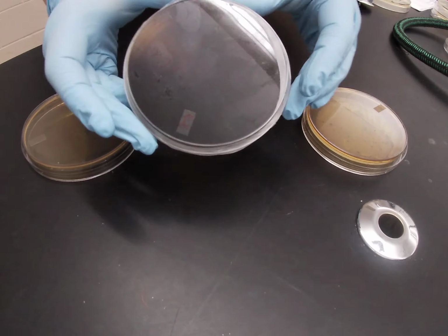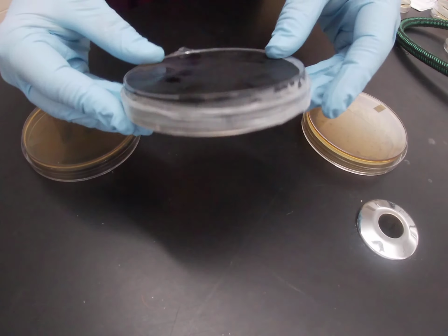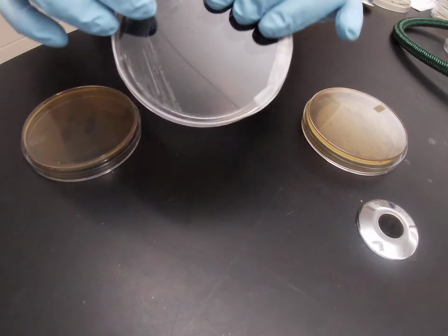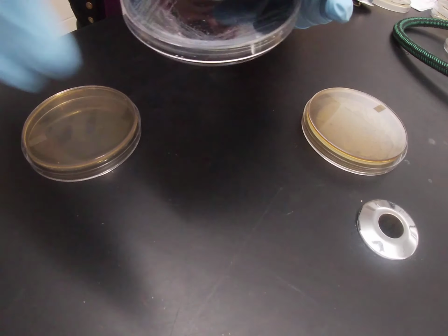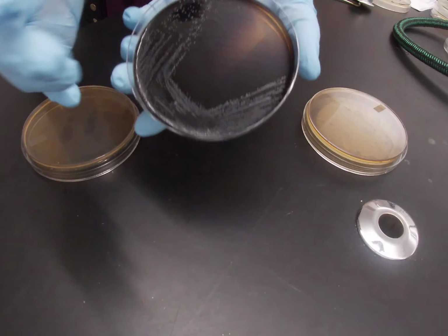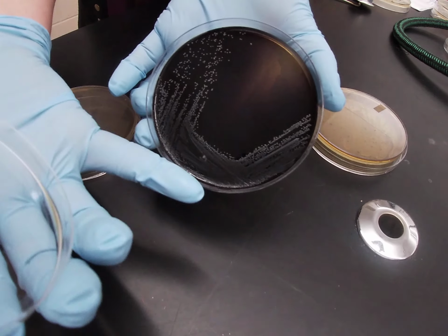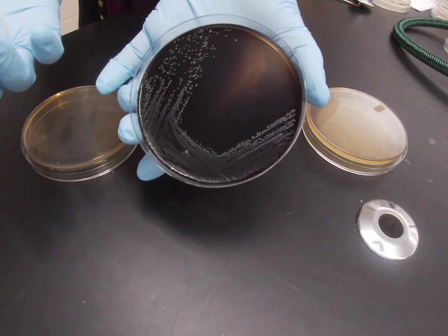Here you can see Enterococcus faecalis growing on a Bile Esculin agar. Enterococcus is able to break down esculin into esculetin, and so because of that, it is able to cause this really dark precipitate on the media. Here you can see the bacterial growth, and then that all black is considered a positive Bile Esculin test.